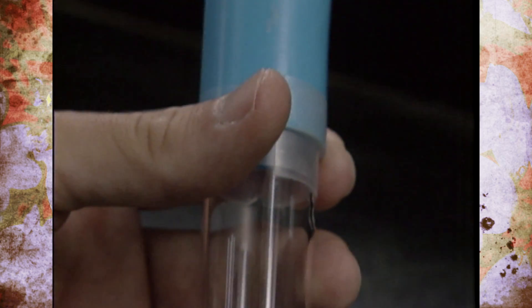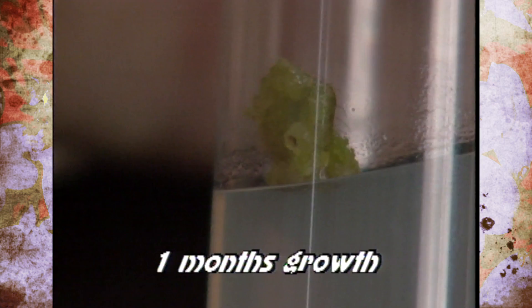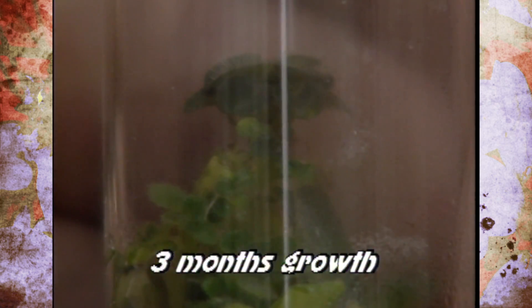We have examples showing how it would look at about one month — you'll see a bubbling mass of cells called callus, which is the precursor to root and shoot initiation. By the second month, very tiny leaves begin to form all around the callus. By the third month you'll have leaves and hopefully roots showing, and they'll soon be ready to be removed and planted into a pot of potting mix. From one disk of tissue we can get hundreds of identical plants — that's the whole purpose of tissue culture, and why it's used so widely in the indoor foliage industry to produce Dieffenbachias, rubber plants, ferns, and so forth.